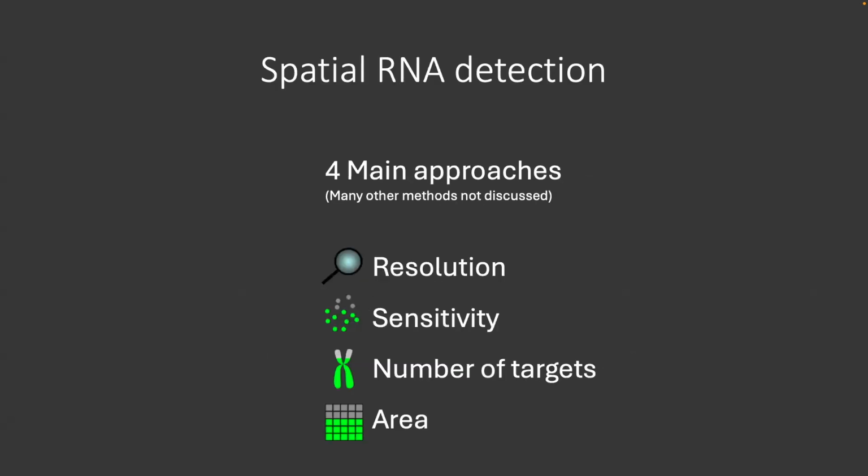So we'll go over the main approaches. I've grouped them into 4 groups. There is a lot more, but we don't have the time to cover all of them. And we will be comparing these 4 main approaches based on their resolution, the sensitivity, the number of targets they can measure, and the area that they can cover in a single assay.